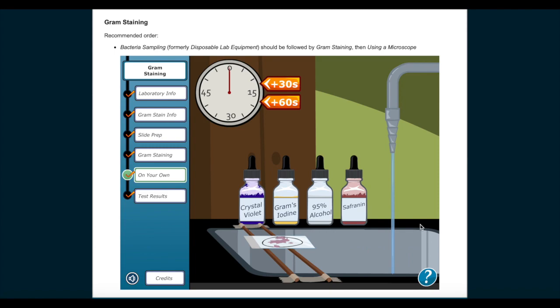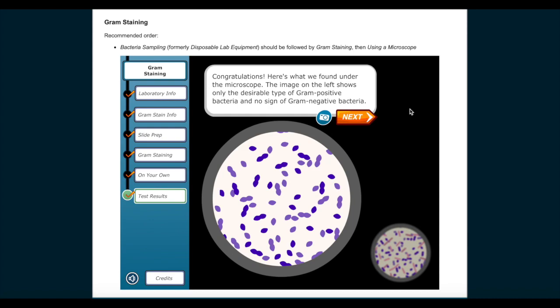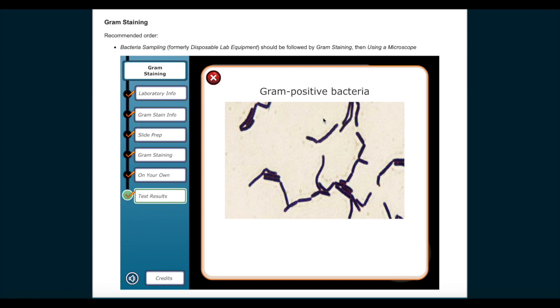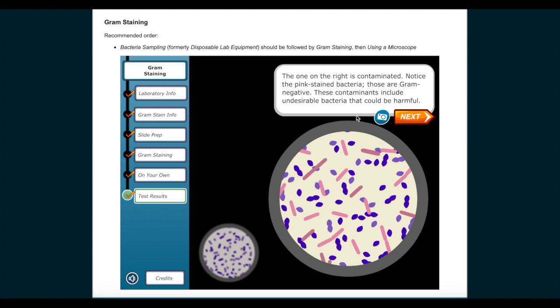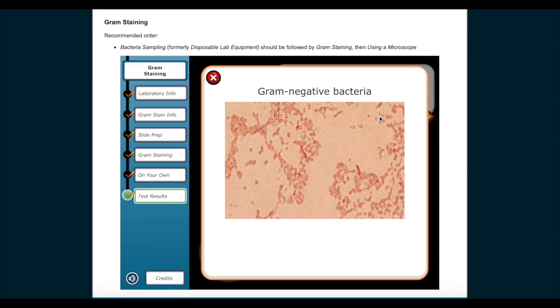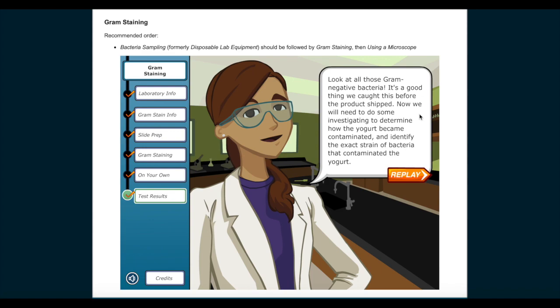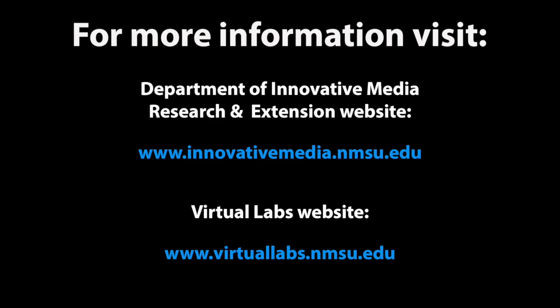Good job. You completed gram staining a slide on your own. Congratulations! Here's what we found under the microscope. The image on the left shows only the desirable type of gram-positive bacteria and no sign of gram-negative bacteria. The one on the right is contaminated. Notice the pink stained bacteria. Those are gram-negative. These contaminants include undesirable bacteria that could be harmful. Look at all those gram-negative bacteria. It's a good thing we caught this before the product shipped. Now we will need to do some investigating to determine how the yogurt became contaminated and identify the exact strain of bacteria that contaminated the yogurt.